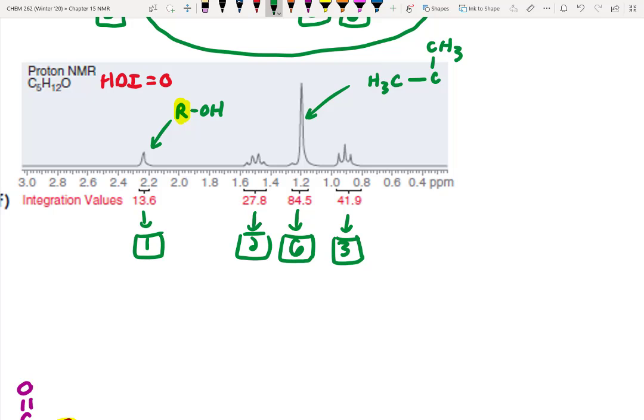All right, and then we know that this carbon right here, how many protons are coming off of that carbon based on the signal splitting for those 6 protons? 0, right? So that purple underlined carbon can't have any protons on it, because if it did, we would expect that peak to be split for those 6 protons. Okay, so let's make a note over here that it must have no protons. So that means we must have 2 R group attachment points. We don't know exactly what they are though.